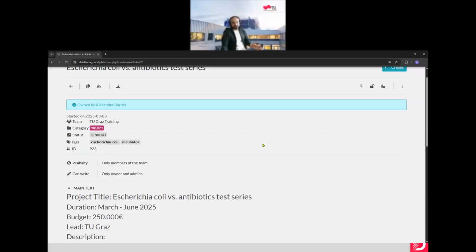I was told that the tags actually work like a classification. So we do not have a folder structure here like we used on our desktop, but we work with tags. All of our entries should have useful and meaningful tags. If I click on one of these tags on the dashboard, for example in the overview, I just get entries that have these tags. And I can also have a more advanced search where I can connect certain text, so I will just get the things I'm really interested in.